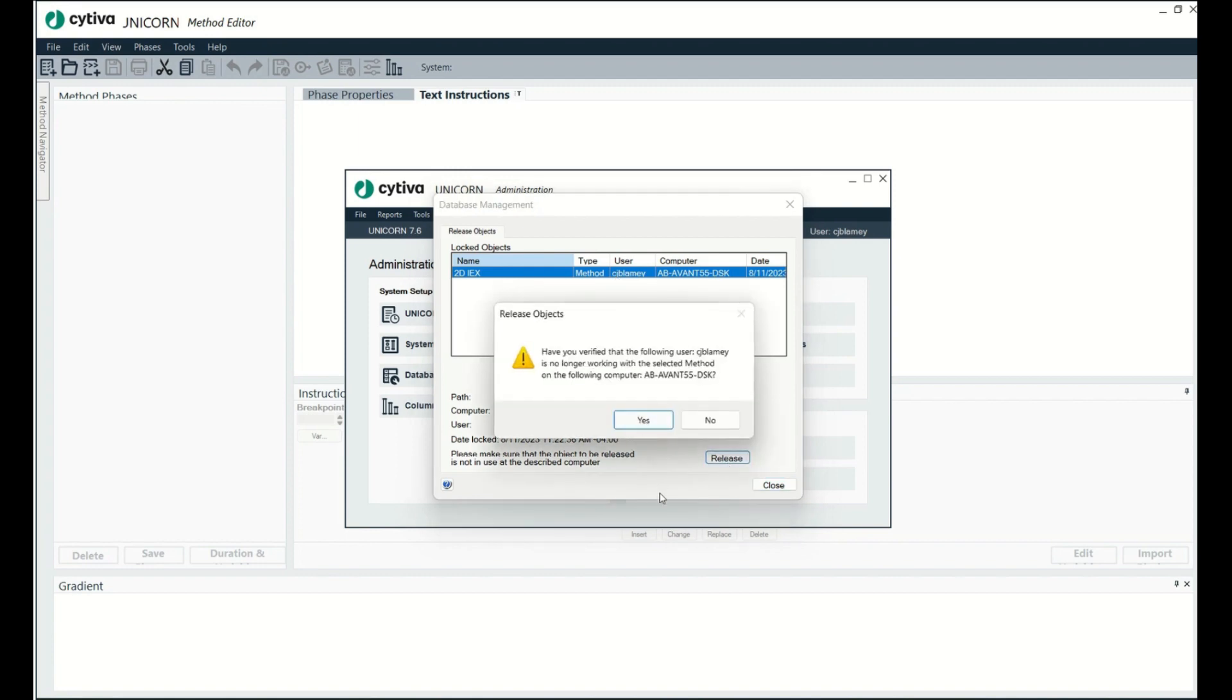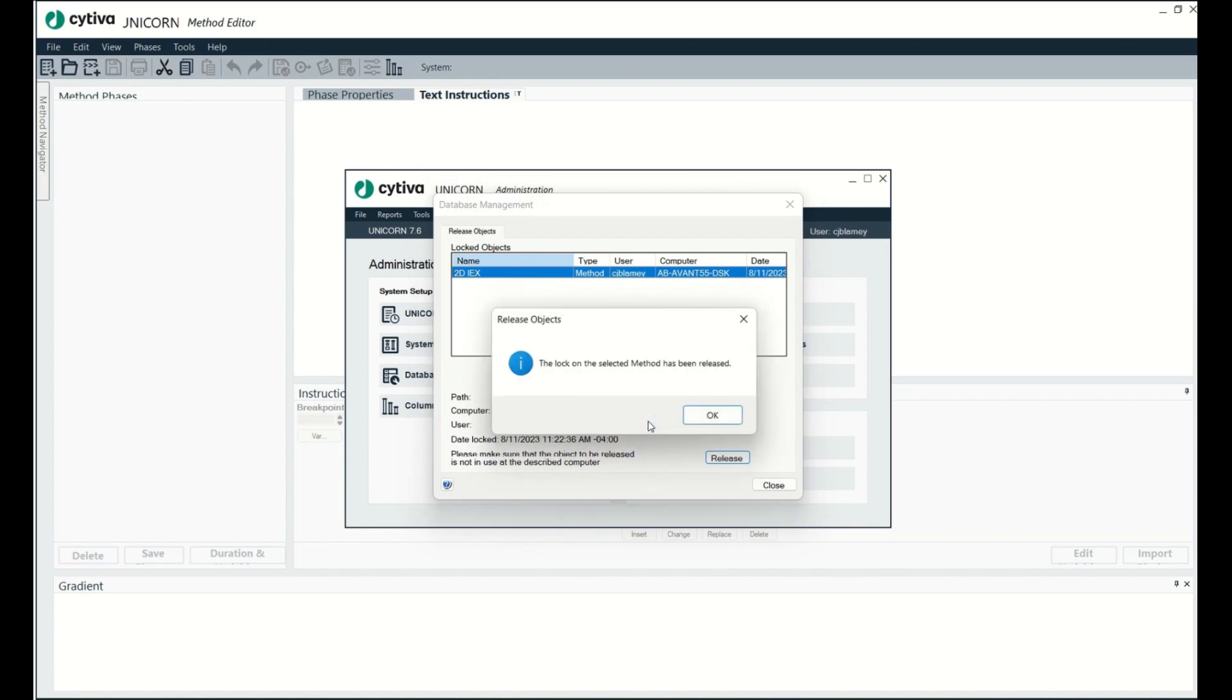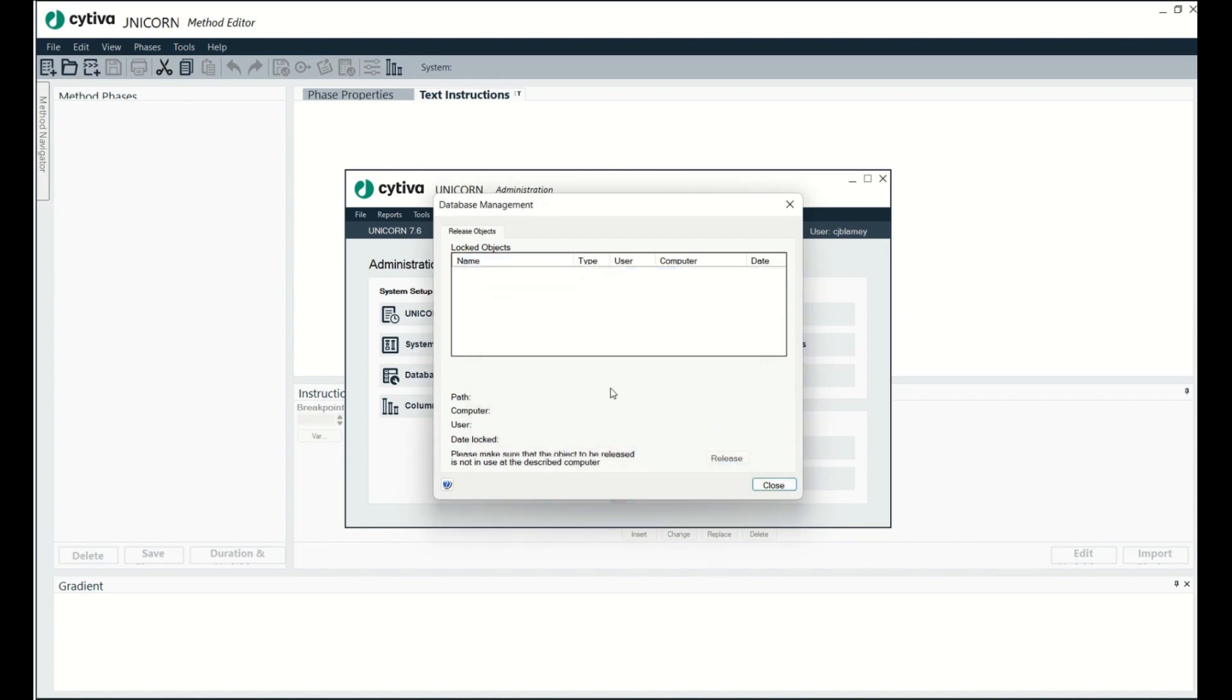It's just that easy. So that's what this is talking about, have you verified the following user is no longer working on it? And yes, that's true. I'm not working on it anymore. Okay, that's it. It's unlocked.